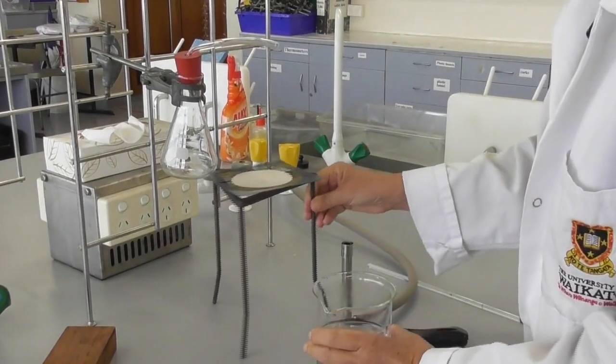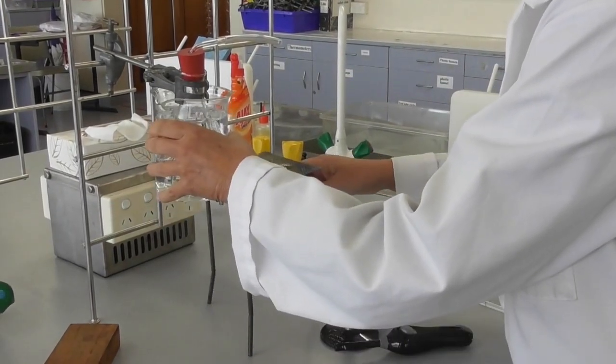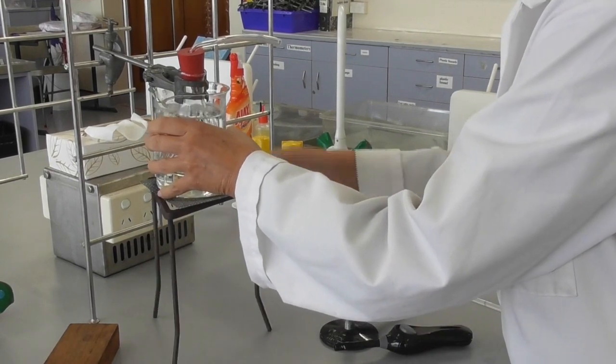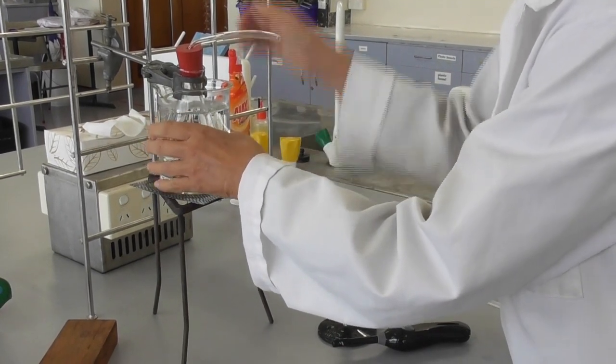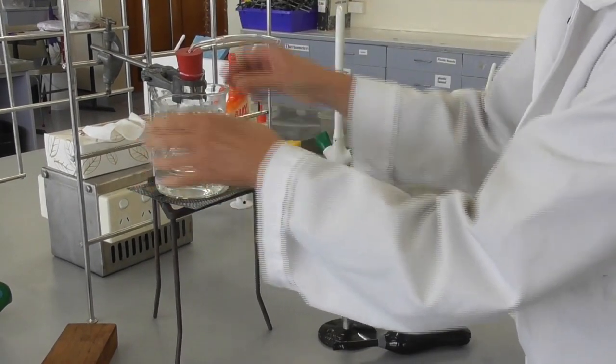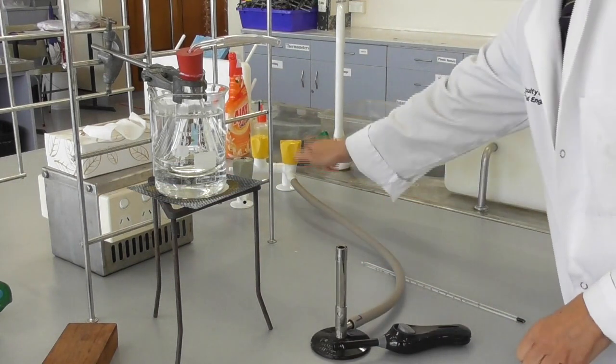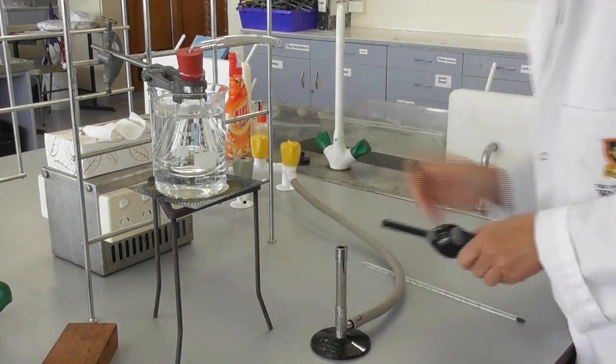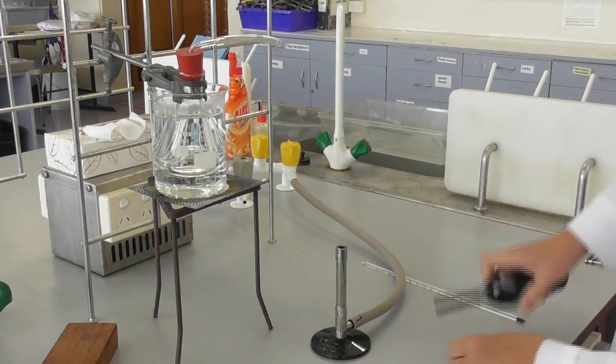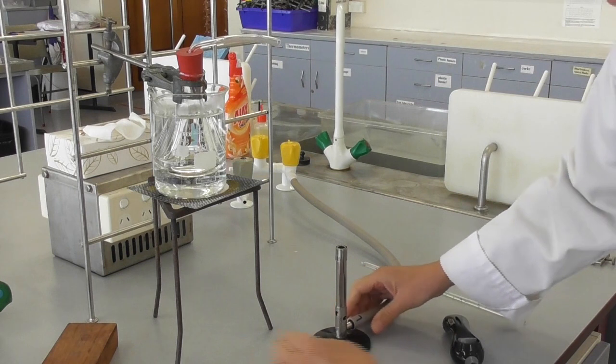Next the flask gets clamped into a 600 ml beaker that is filled with water. We want to make sure that the water covers almost all of the Erlenmeyer flask to ensure that we get the temperature of the water inside the flask as well.